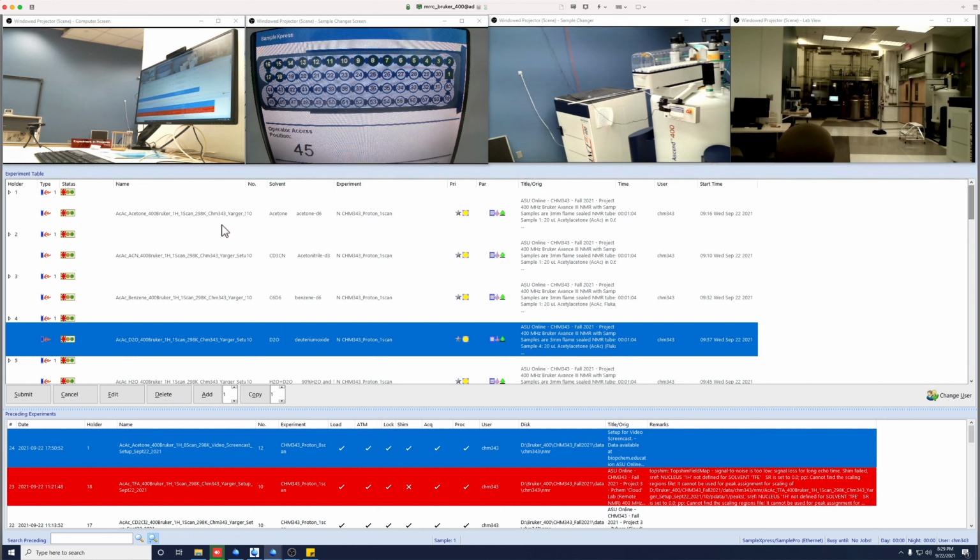Okay, so now just starting, why not here? It's sitting at position 1, but if we wanted to run a sample, say this one, acetylacetone in D2O, it's on this 400 megahertz NMR. All of the setups did a simple proton 1 scan at 298. And for this class, all of these are for a specific class where we're looking at the physical chemistry, the equilibrium properties of diketones in different solvents at different temperatures, etc.